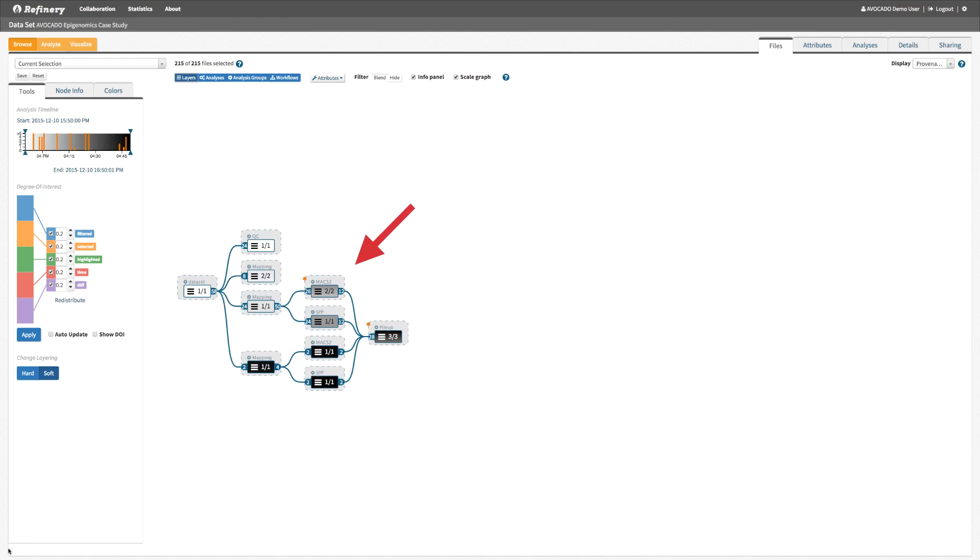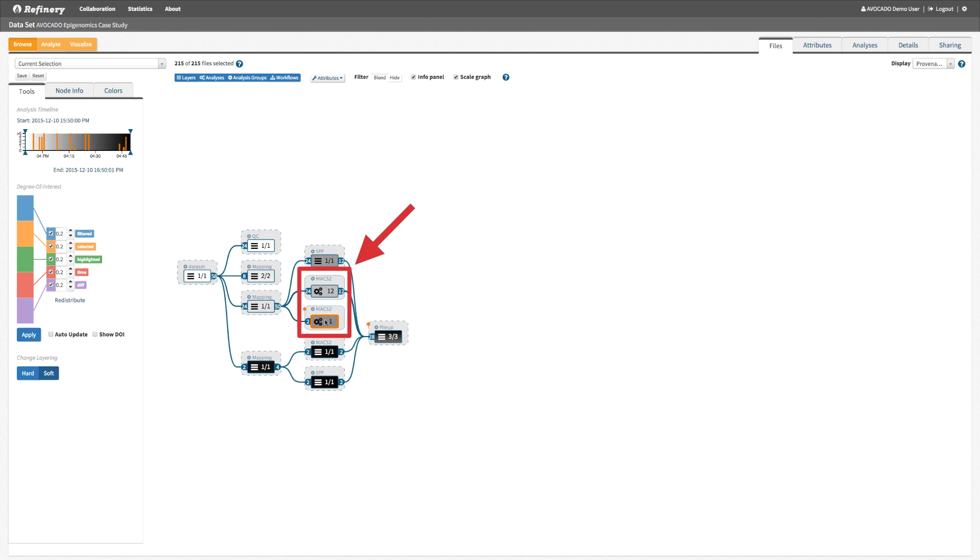Let's investigate a layer node marked with a change indicator. The orange asterisk indicates that not all of the analyses in this layer have the same parameterization. Indeed, the two analyses in this layer have different numbers of analysis input groups and their outputs are routed differently.